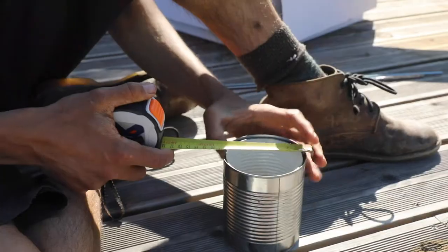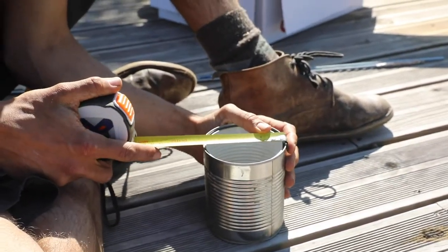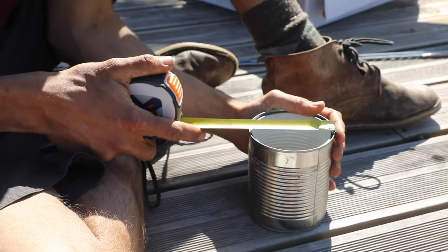Then we measure the height and the diameter of our ring so that we can calculate its volume. Record this on the datasheet.